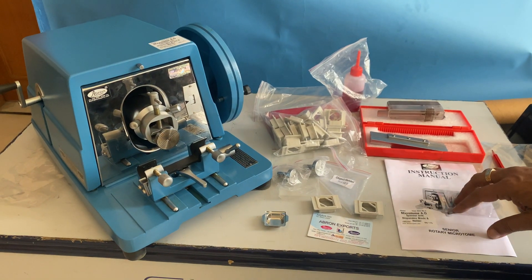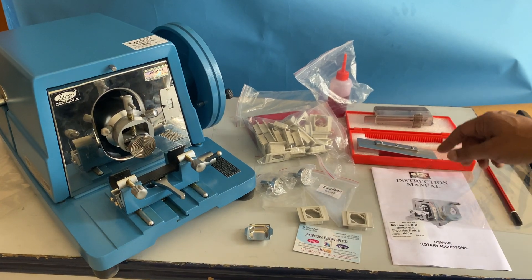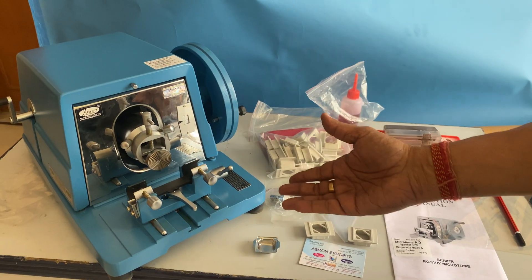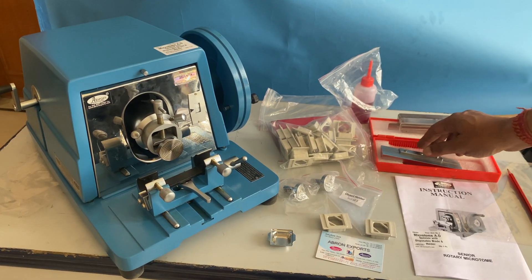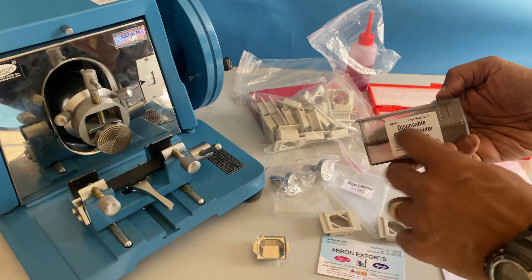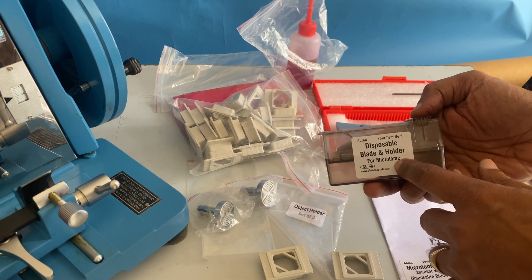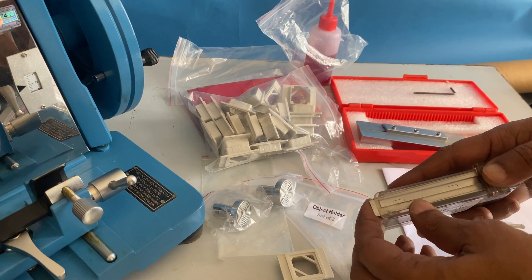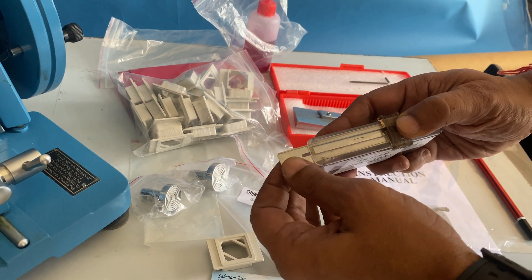Let us learn how to use the AO Spencer type microtome by Abron. First of all, see the other two videos available on YouTube. There is a disposable blade holder which generally comes for about 50 blades, for high soft tissue and hard tissue. You push it here and one blade comes out.